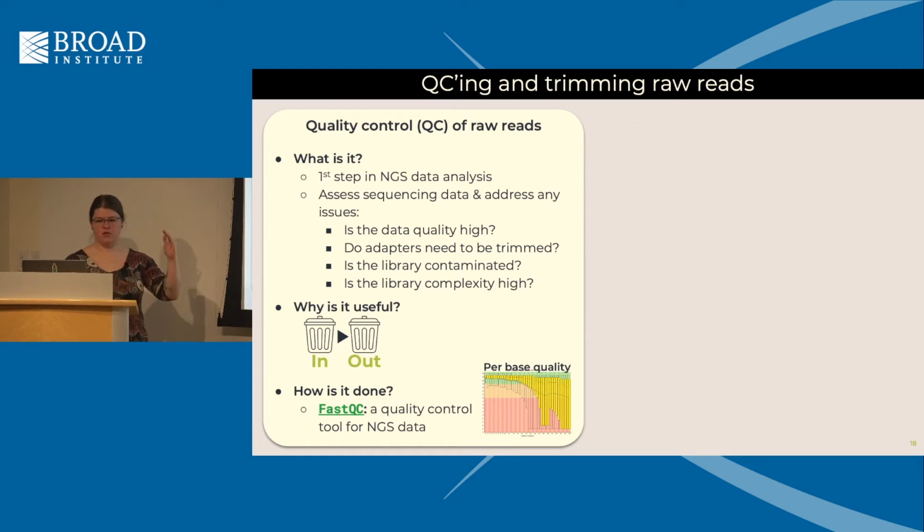So this is like the first step. And then FastQC, there's some other tools too, but FastQC is on-prem. I think there's several Docker images where you can access FastQC on Terra as well.